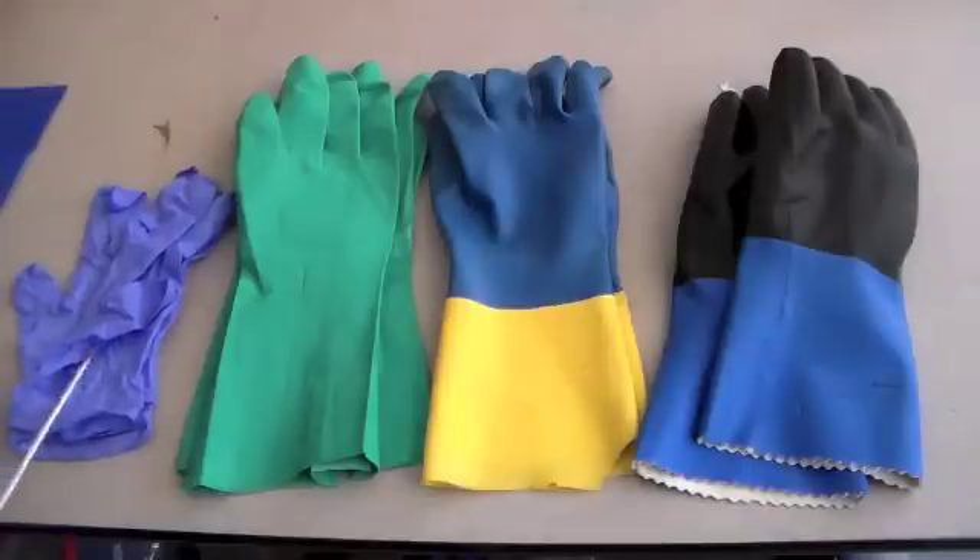Starting with disposable latex — this is the least beneficial glove to wear. It can be used for dilute solutions of mild irritants, and those solutions must be aqueous, such as inorganic salt solutions and diluted alcohols. You can't even use latex with pure or concentrated alcohols.